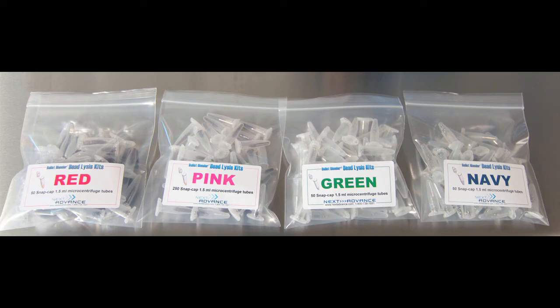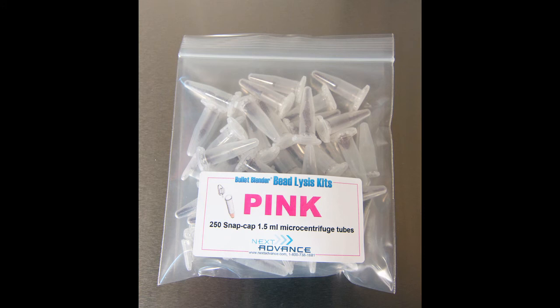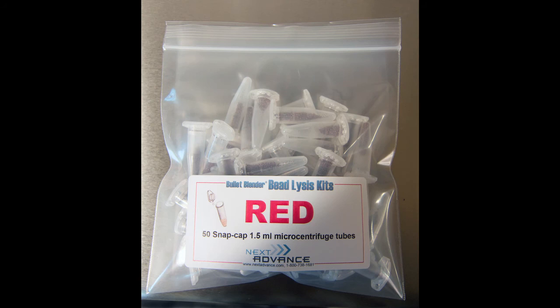Alternatively, to save time and still get great results, you can use the Nextadvance bead lysis kits to homogenize your samples. Pink kits are pre-filled tubes that can be used for soft or medium samples that are under 100 milligrams. If your medium or soft samples are over 100 milligrams, use a red kit tube. Load your samples into the tube and add a volume of buffer equal to twice the volume of beads that you are using.